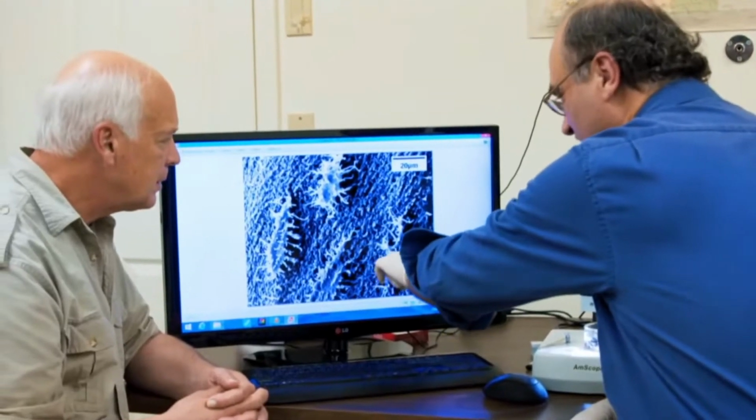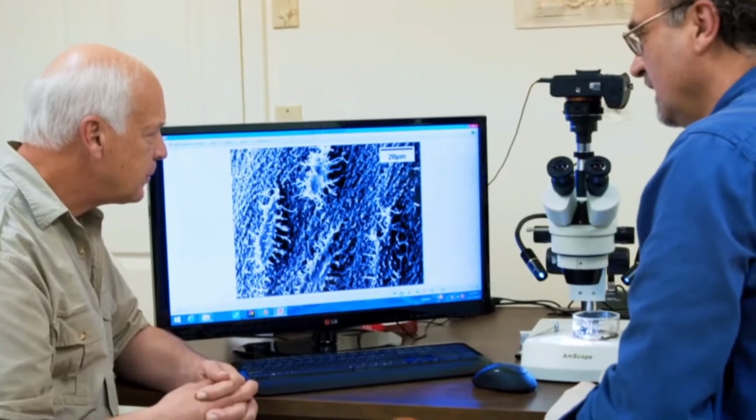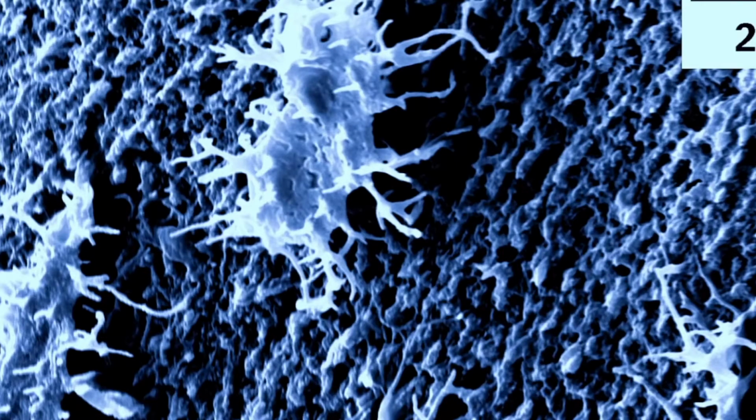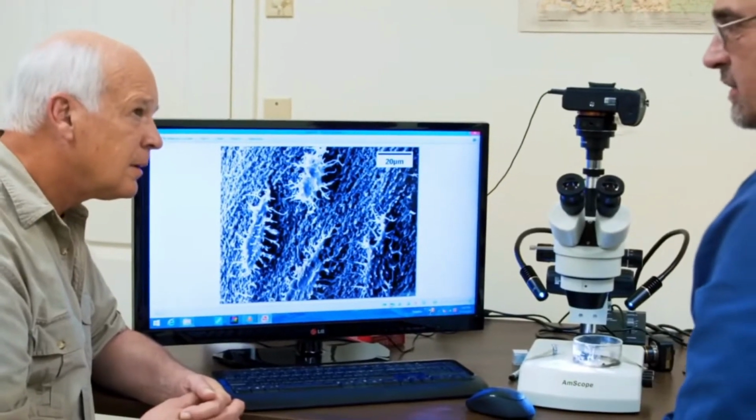We would not begin to expect to see such enormous and elaborate detail. These structures are incredibly small. This is our 20 micron bar here. See how small these structures are, still intact. To see that kind of detail, the preservation process is obviously surprising to everybody.